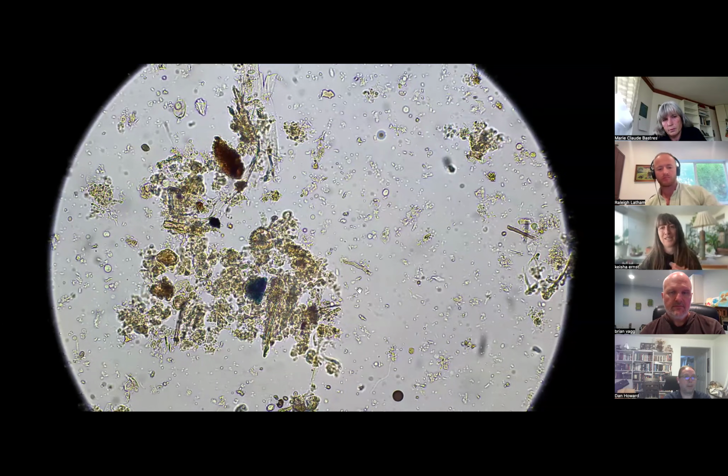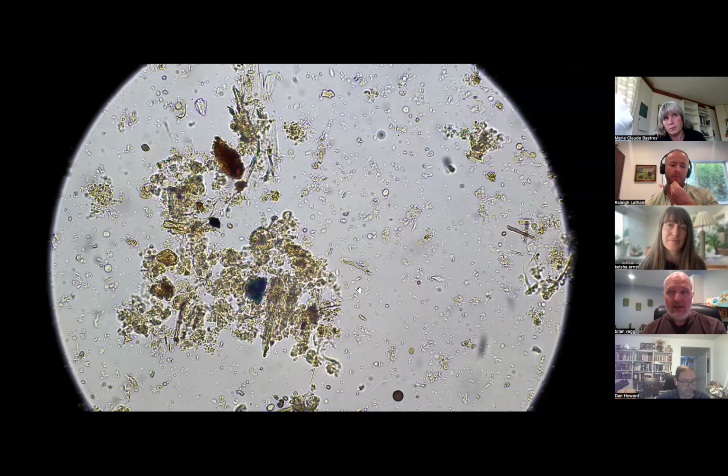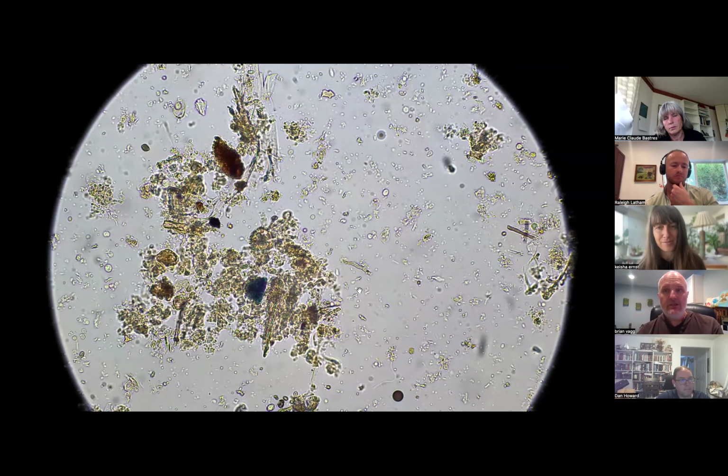Setting up a microscope, making samples, that stuff's hard enough. So that's what we wanted to really demystify, right? The complexity around using a microscope. Once you get the basic skills of how to use a microscope, boy, the world is an oyster. You can go and start to observe all kinds of things, and it just helps.